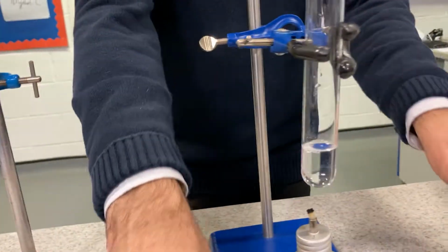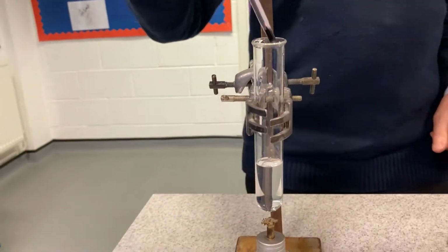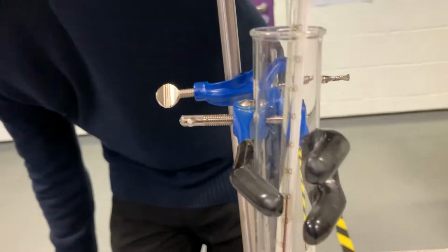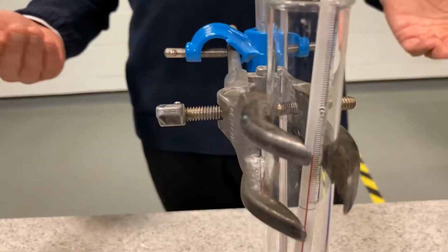Right, I'm going to pop the thermometers in. Thermometers in, I'm going to give them a moment just so they adjust. But I mean, they're all at room temperature really. So it should be roughly 20 degrees. And if I look at this one here, we are indeed on 20 degrees. And we're going to burn these and we're going to see which one's best.